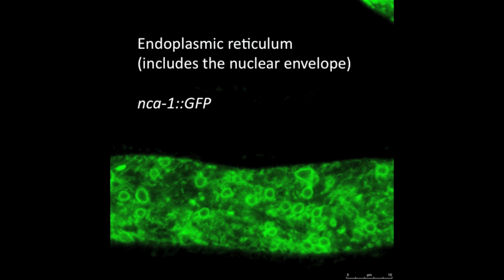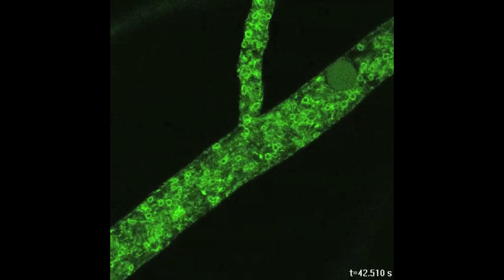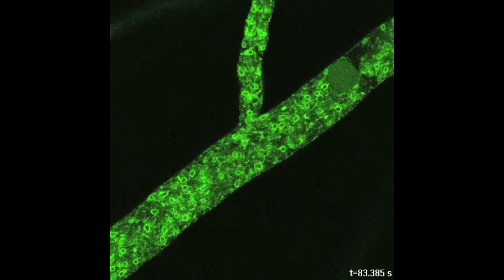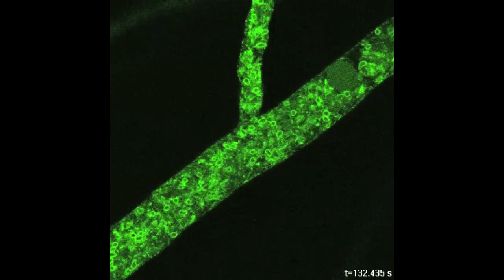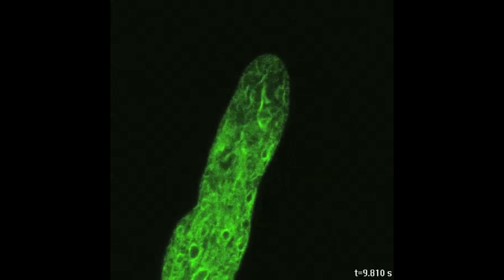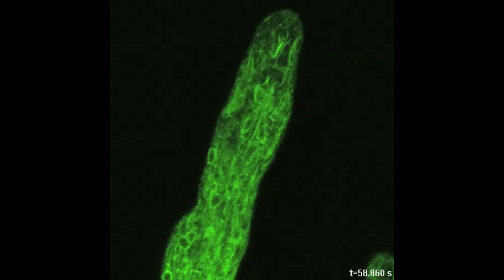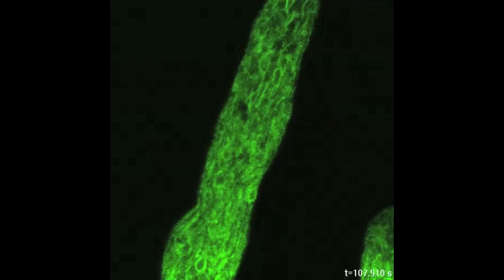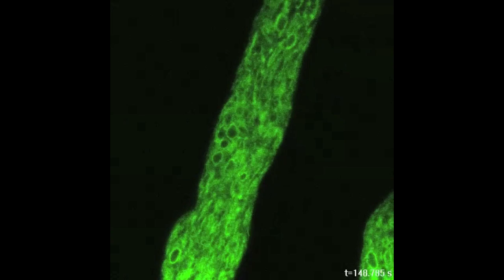Proteins that localize to the endoplasmic reticulum are also seen in the nuclear envelope. In fact, we know that the nuclear envelope is really just a specialized region of the endoplasmic reticulum. The ER is also made of many other small membrane fragments, although in Neurospora, the endoplasmic reticulum doesn't seem to be as highly structured as it is in some other organisms. At the tip, the membrane fragments are more abundant than the nuclear envelopes themselves. The nuclei at the tip are also quite more variable in size, and you see a lot of small nuclei that you don't see back in the older hyphae.